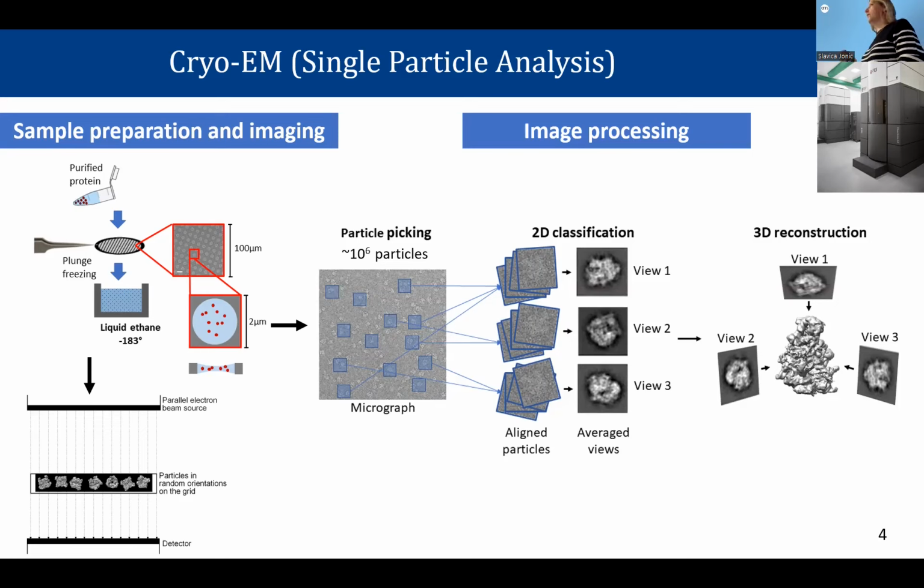Because we know that the complexes change shapes, and sometimes these conformational changes are very large, people will typically do some classifications. They can be 2D or 3D classifications, but at the end of the day, they will not end up with one structure, but with a few structures. For example, this is your compass and it is opening and closing. So you will maybe have 3-5 classes: one for this shape, one for this shape, one for this shape, etc.